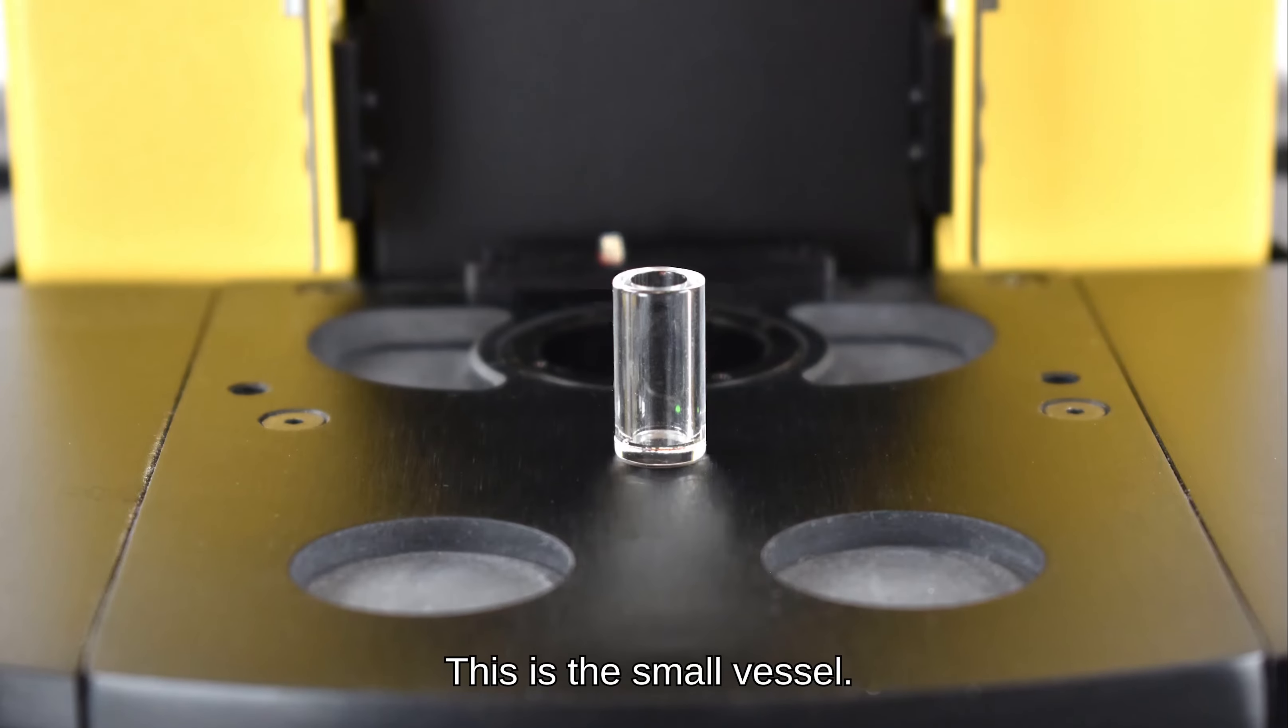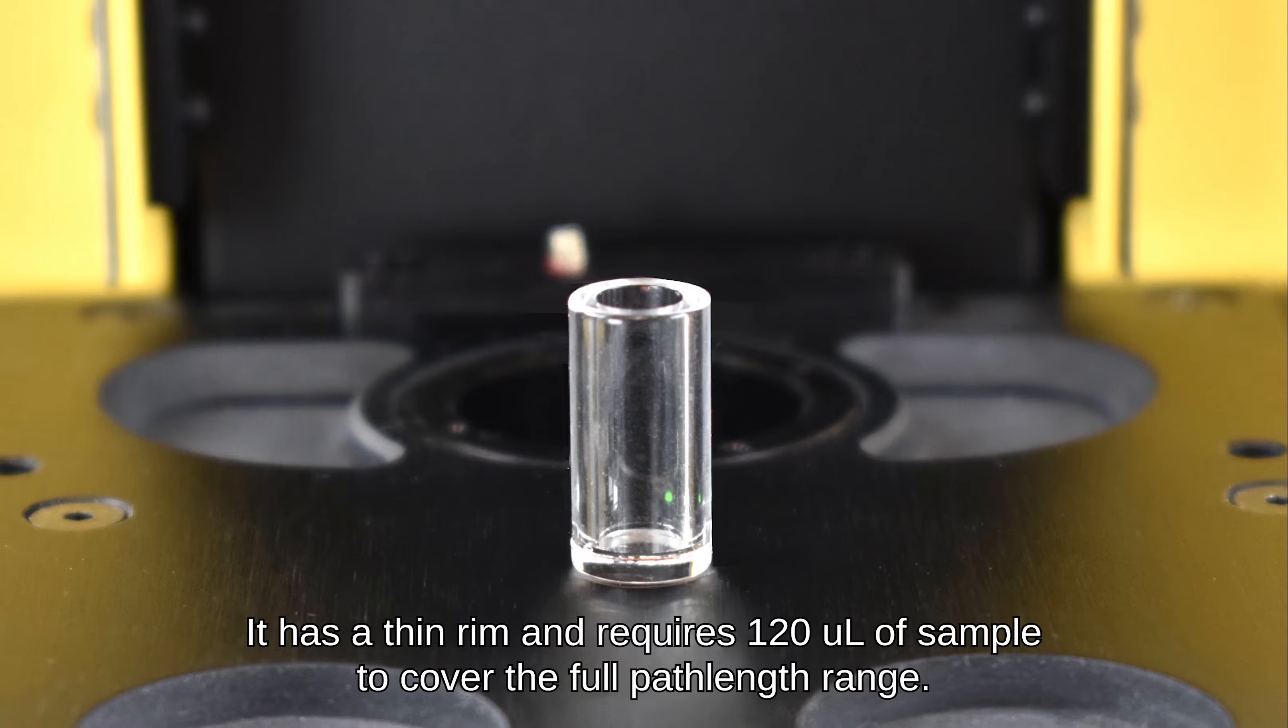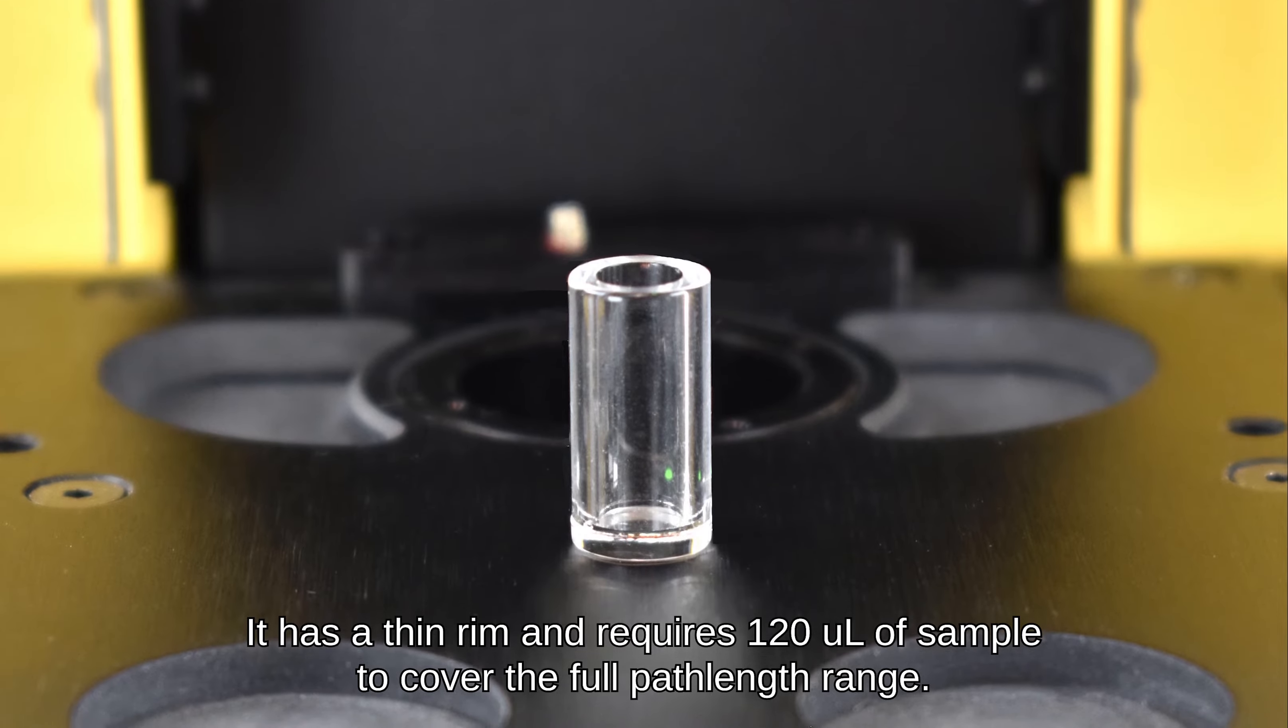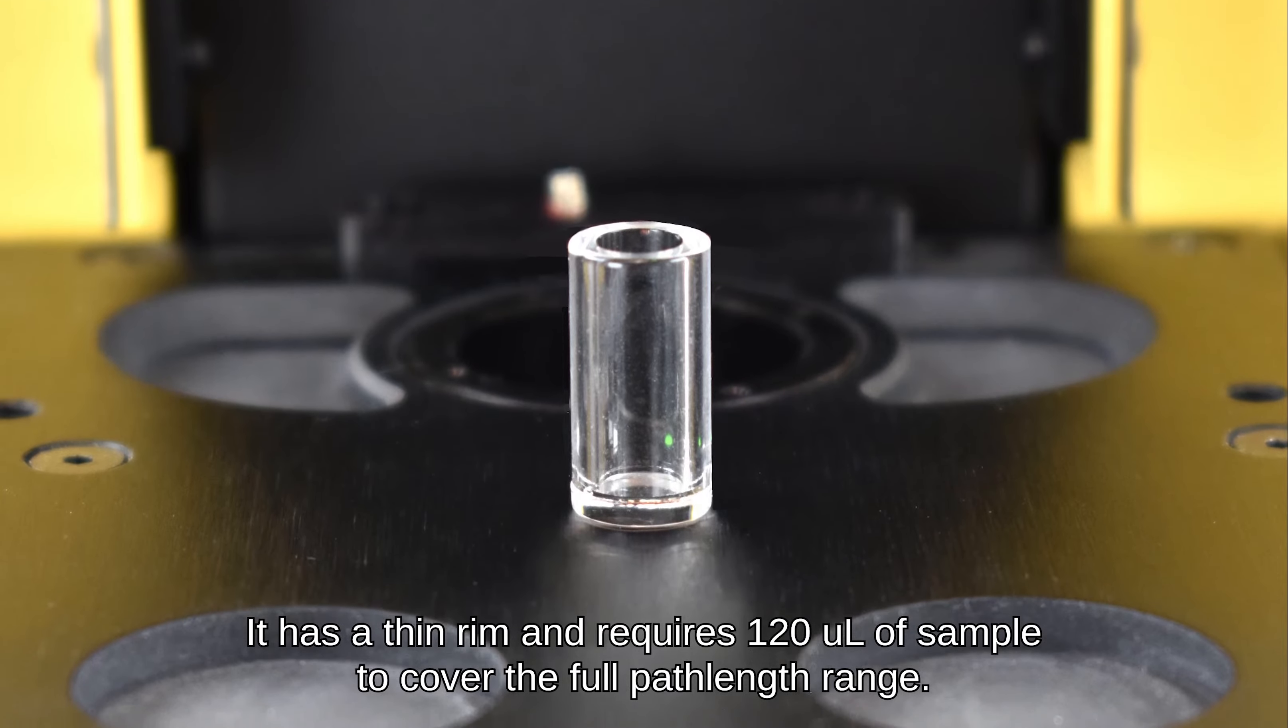This is the small vessel. It has a thin rim and requires 120 microliters of sample to cover the full path length range.